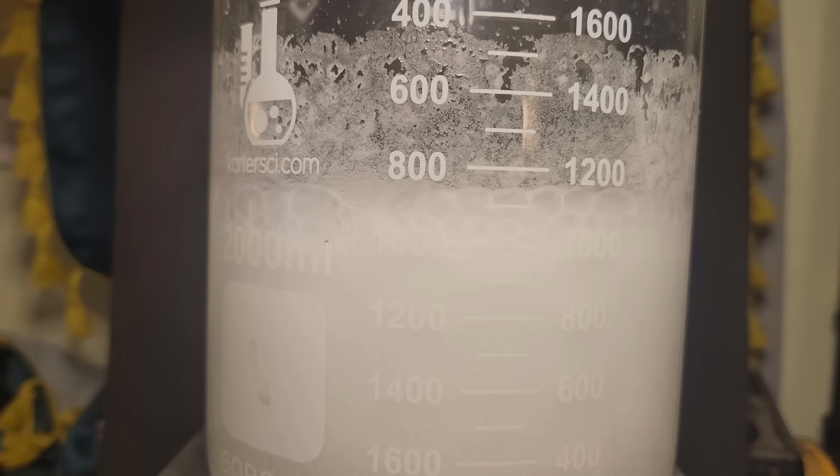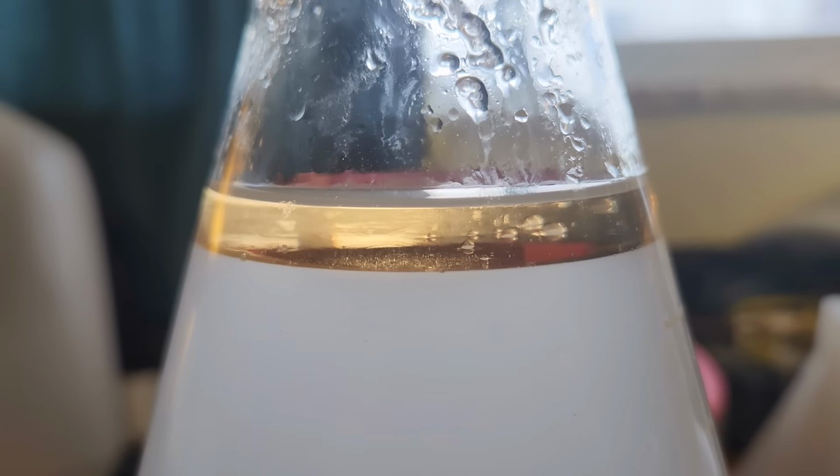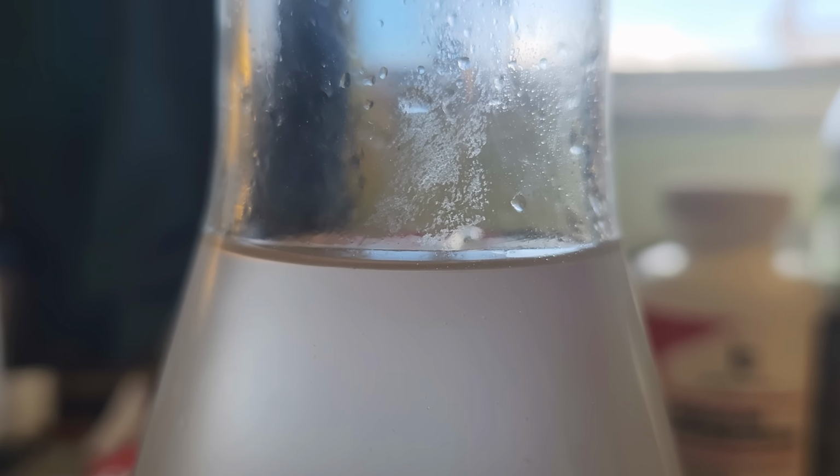Also, as a side note, there's this weird oil stuff that floats on the surface of the solution. Even after attempting to filter it out, there's still some left over and I don't have a clue what it is. If you recognize this, let me know in the comments because I'm curious to know what it is.